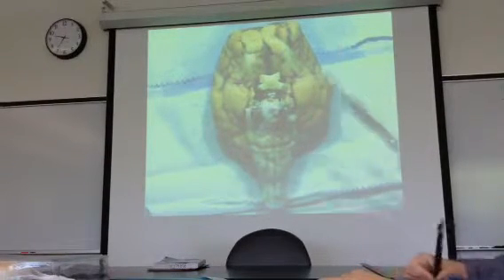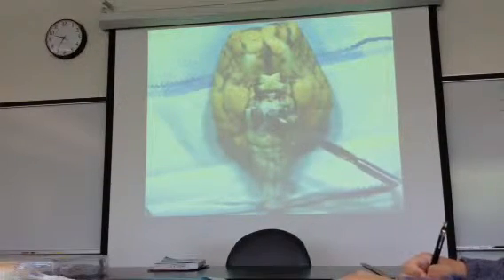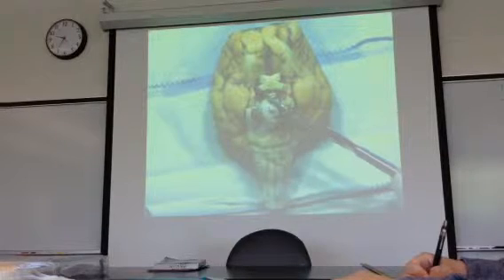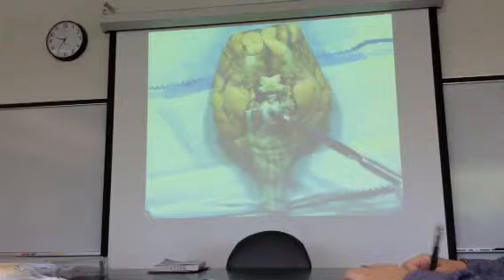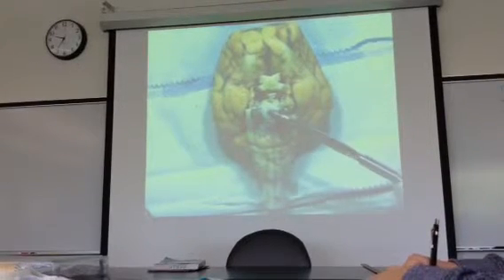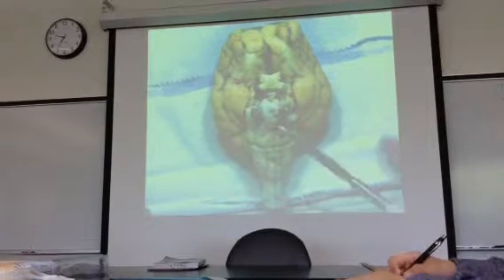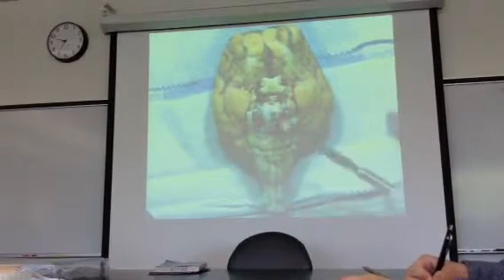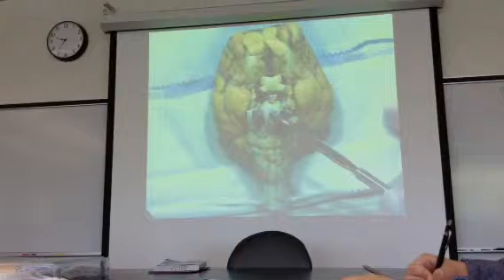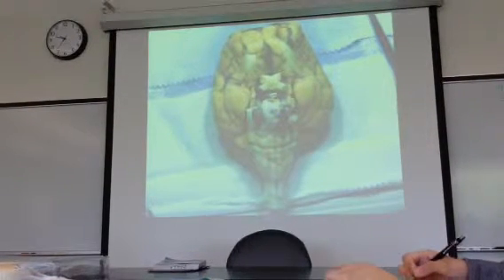Okay. It's kind of a mess right here, isn't it? That's because this is the pituitary gland. On the sheep brain, I'm not going to have you differentiate between anterior and posterior pituitary, but you should be able to identify the pituitary. Some of the brains in the sink have the pituitary still in place. Some may be missing the pituitary gland. If it's got a pituitary gland on it, you're going to have to remove it because it's covering up other assigned structures. Let me show you how you're going to do that.